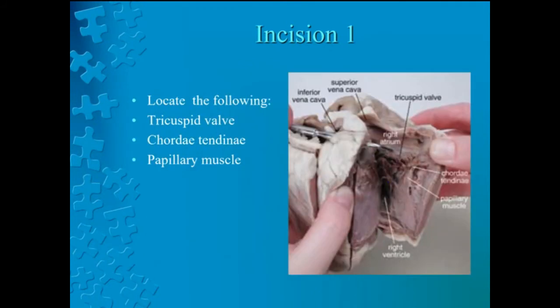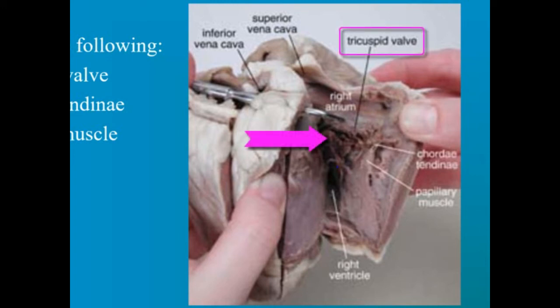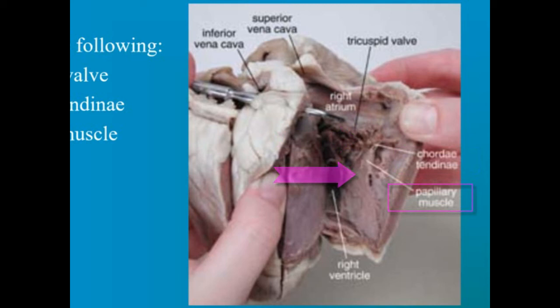Now that you have made the incision, pull the two sides apart and look for three flaps of membrane. These membranes form the tricuspid valve between the right atrium and the right ventricle. The tricuspid valve was named so because it has three cusps or flaps. This valve allows blood to enter the ventricle from the atrium but prevents backflow of blood from the ventricle into the atrium. Chordae tendineae, or heartstrings, are the tendons that connect the papillary muscles to the membranes of the valve. The valve acts much like a door that opens in only one direction. The tricuspid valve is one of two atrioventricular valves, also called AV valves. The right AV valve is called the tricuspid valve. Pause now to locate the listed items.